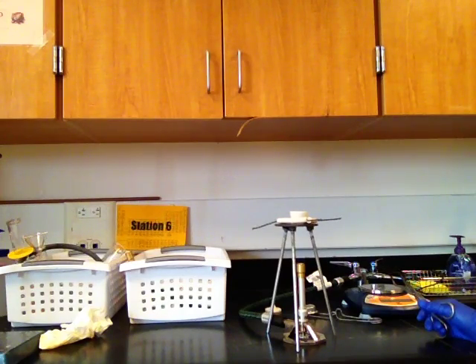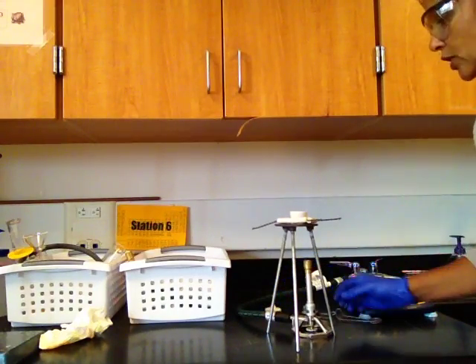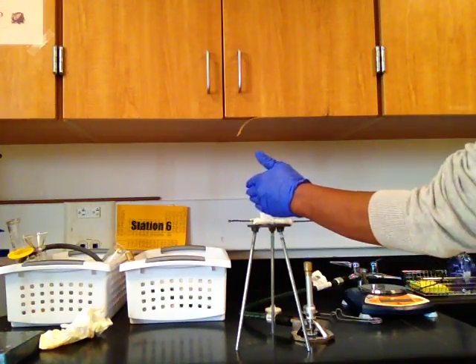The idea is to burn any combustible impurities. You heat up for about 4 or 5 minutes, and then you turn off the burner, or you can move the burner aside. Make sure there is nothing else combustible there, and let the crucible cool. You would know that the crucible is cooled if you take your hand near it.